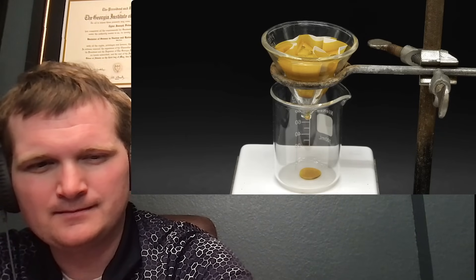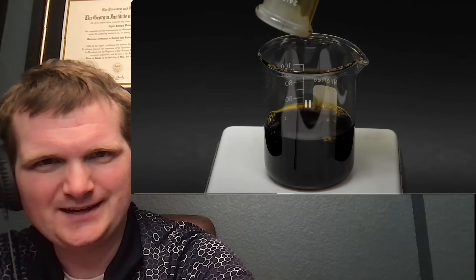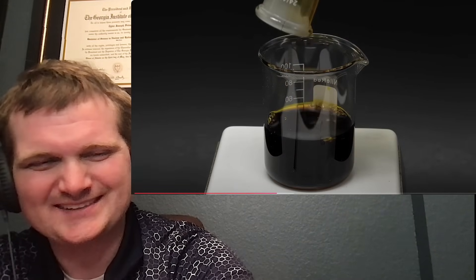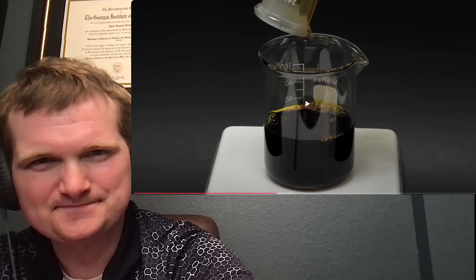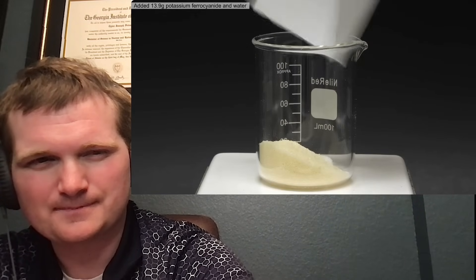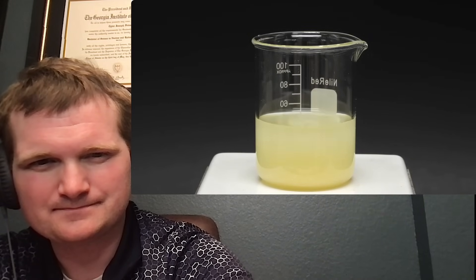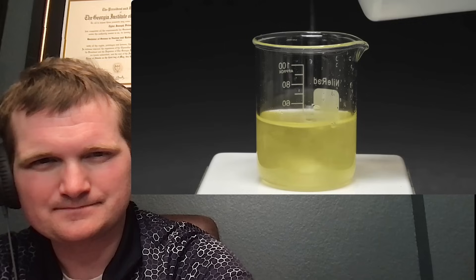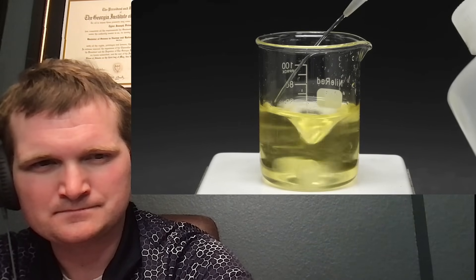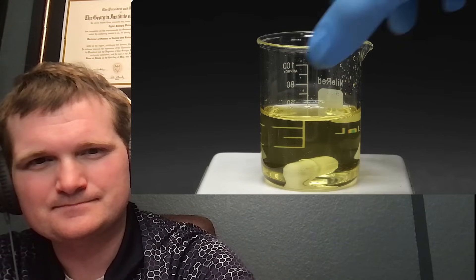To get rid of the undissolved solids, I tried a gravity filtration but it was just way too slow, so I instead set it up for a vacuum filtration, which left me with a really nice and dark solution. I dumped it all into a small beaker and moved on to making the second solution I needed. This time I added 13.9 grams of potassium ferrocyanide and again filled it up to around the 50 ml mark. I let it stir for a few minutes and it mostly cleared up, but there was still some undissolved stuff so I added some extra water.